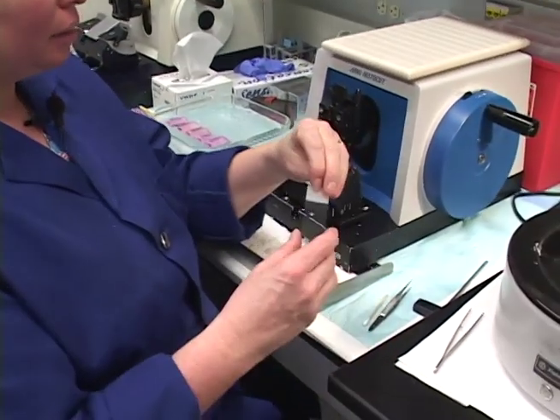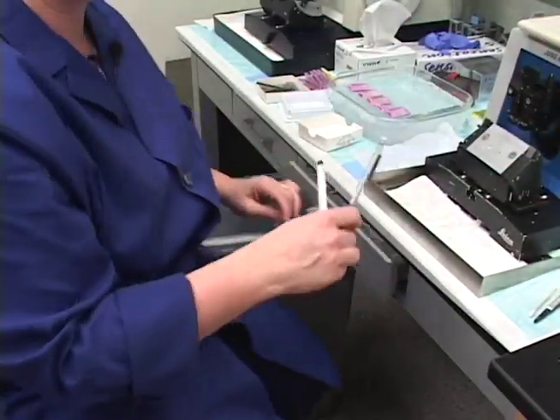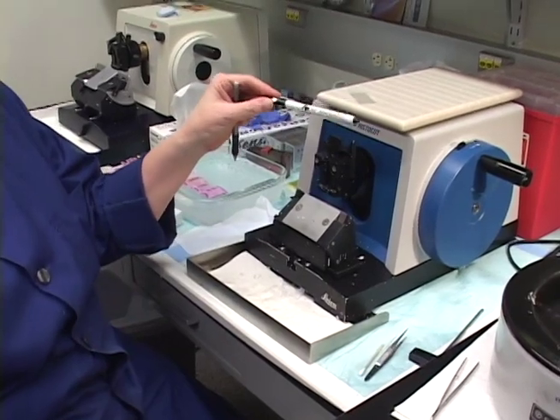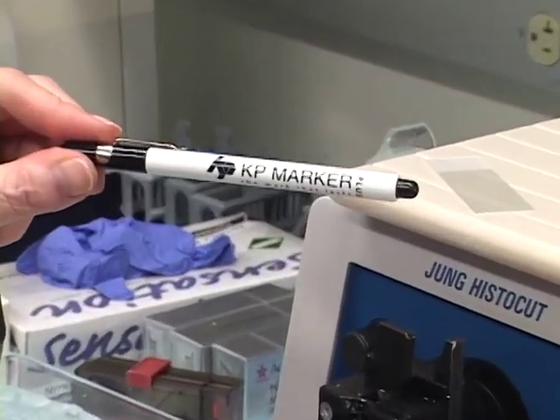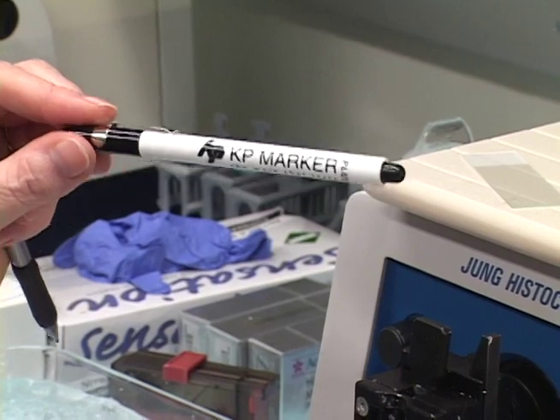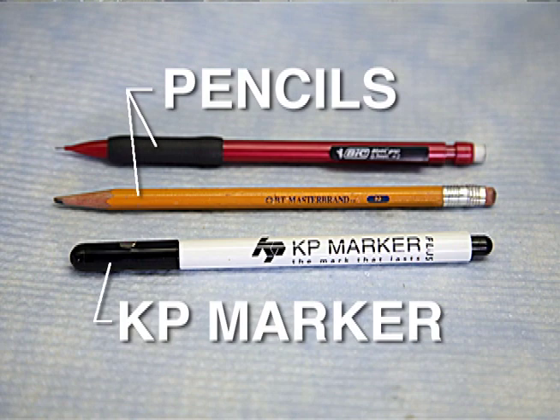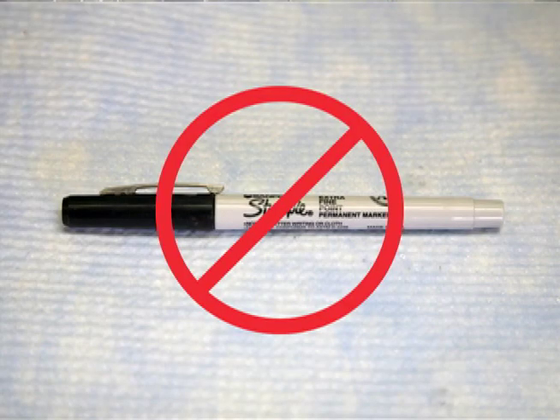Here's our plain slide. It's better to not pre-label your slides. For labeling, you want to use either a regular number two pencil or a KP Marker Plus — I highly recommend this brand because it makes it through silver staining, microwave techniques, immunohistochemistry, and in situ hybridization without coming off. What you don't want to use is any type of Sharpie — it comes right off with any alcohol and you won't know what your slides are labeled.